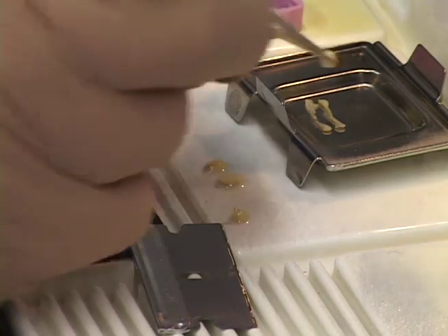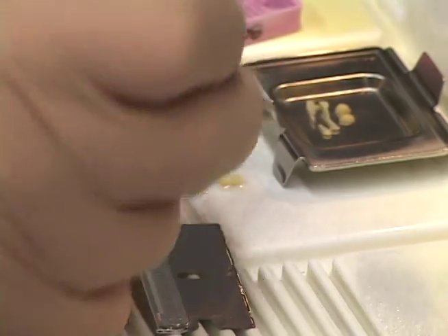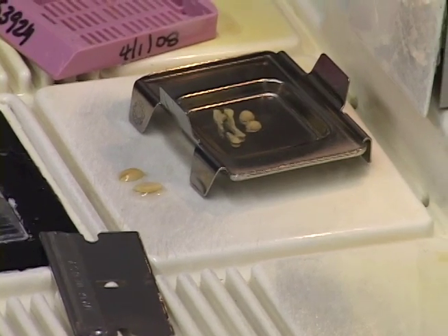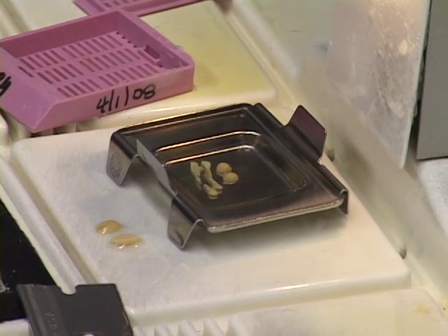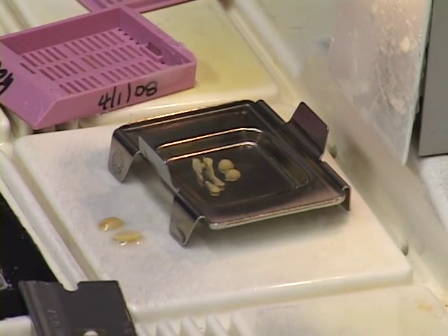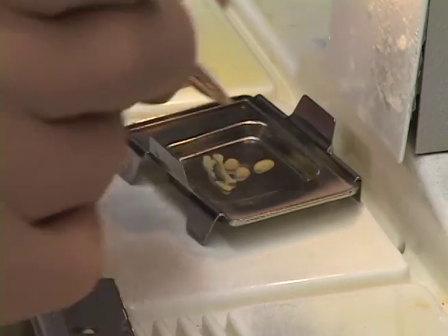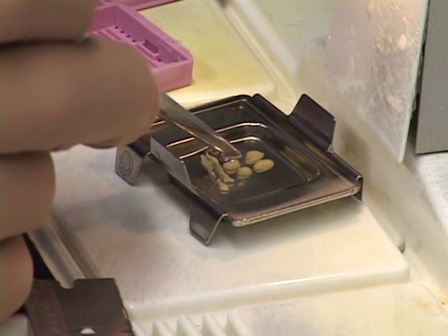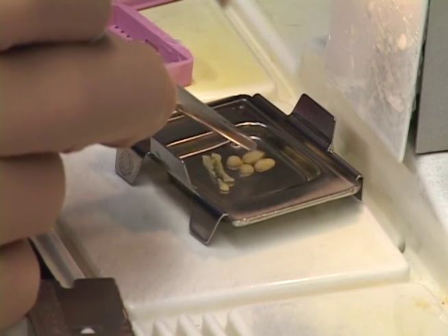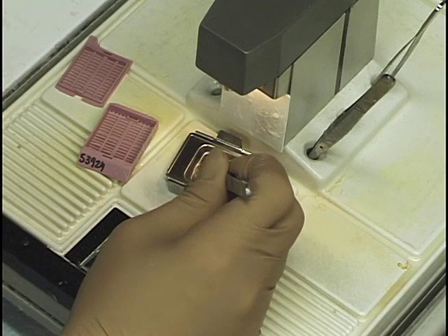In our lab, we consistently do the same thing — and it's important to be very consistent in what you embed and how you orientate it. That consistency shows you know what you're doing. I put the longitudinal sections on top, the cross sections next, and the epididymis at the bottom. Keep them orientated nicely, always in the same way, same direction, nicely centered.